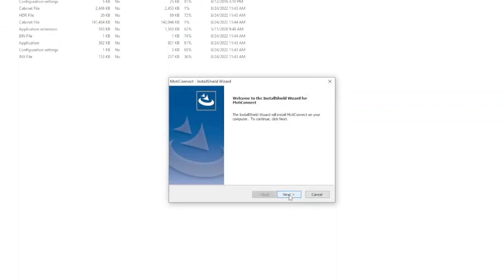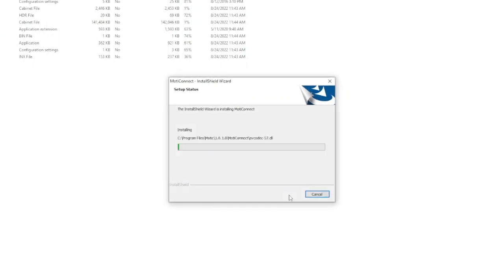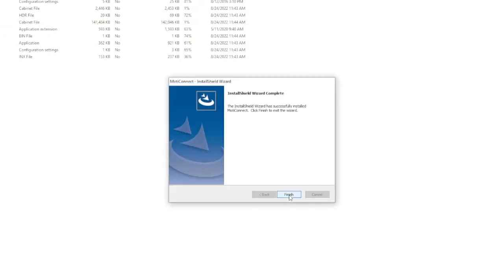Simply follow the instructions on your screen, select next and then choose the destination folder. The default folder will be displayed but it can be easily changed to the preferred one. Then click install, wait a few seconds for installation to continue and then click finish.